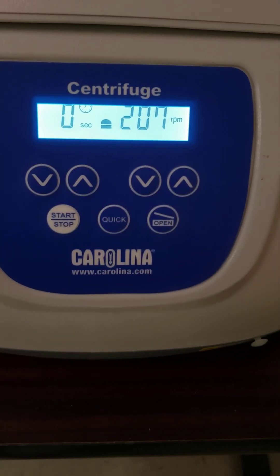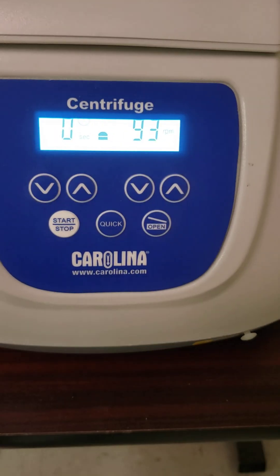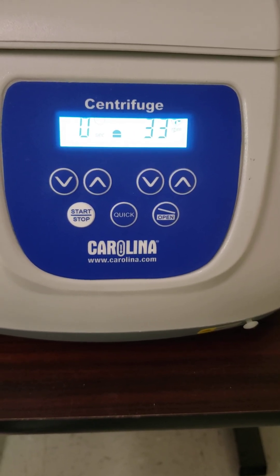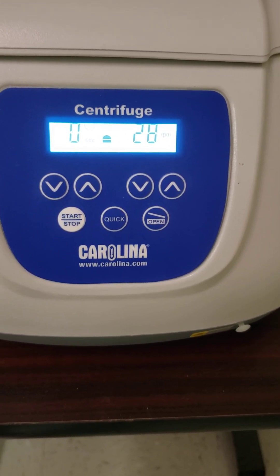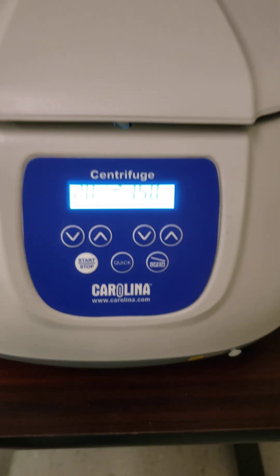Let's see the centrifuge slowing back down again. And when it hits about zero, it'll pop back open here. There we go.